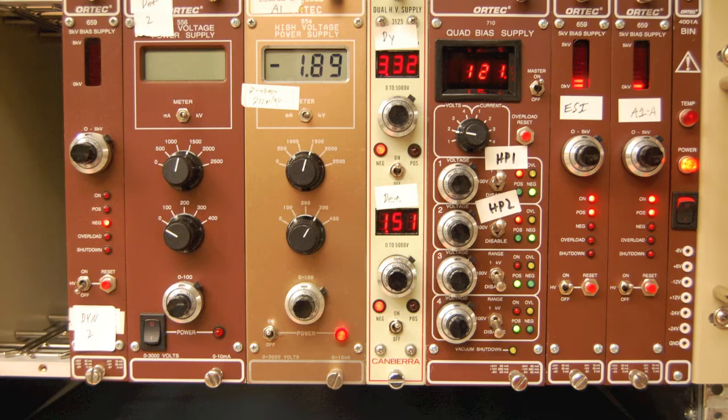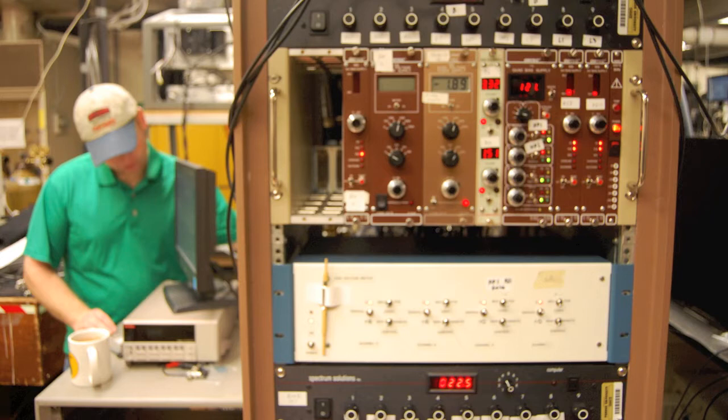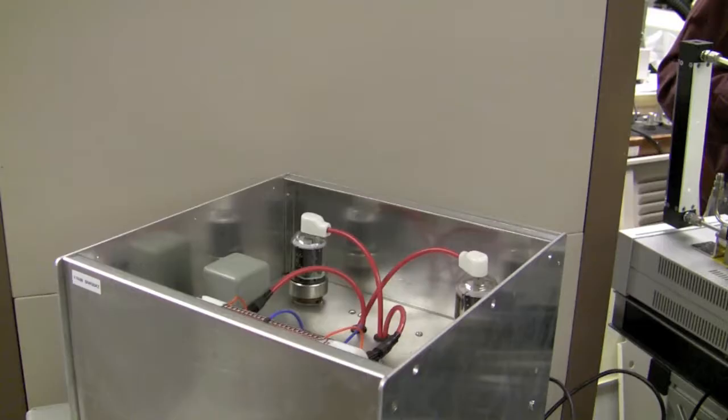They have, in fact, been involved throughout the building and construction and testing that we've done to date on this new instrument. In particular, their experts, Rob Oglesby, has been really working with one of our students, James Redwine, on a daily basis. And they're building these RF circuits, these radio frequency circuits, that are used to trap the ions and mass analyze them. They're electronic circuits that are designed to do that.